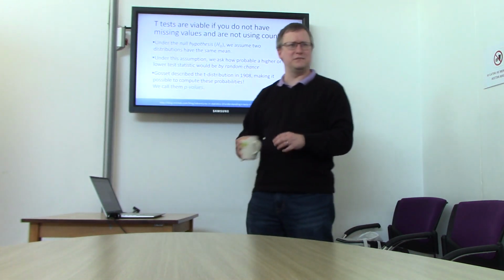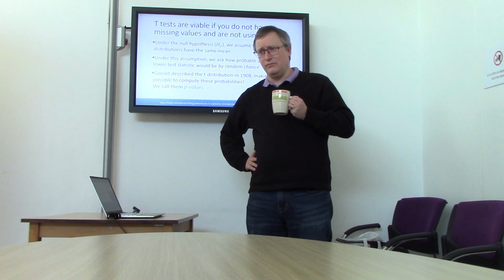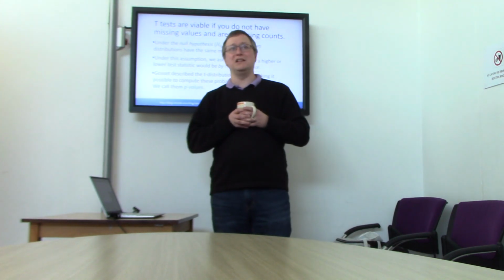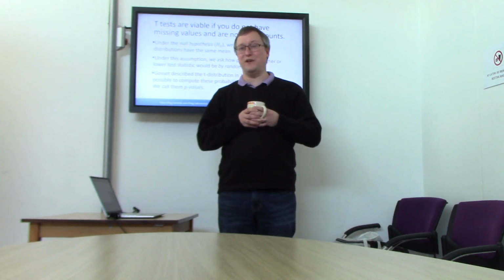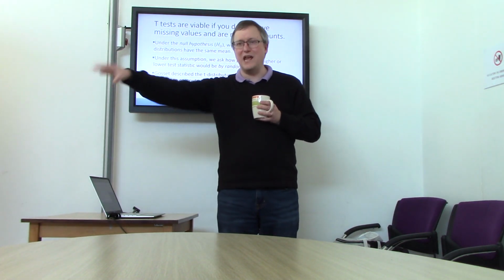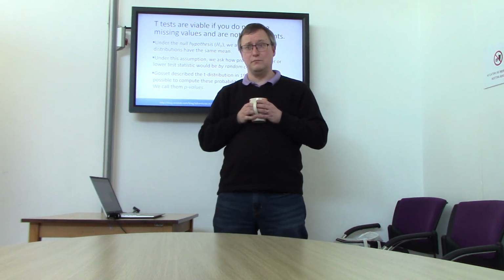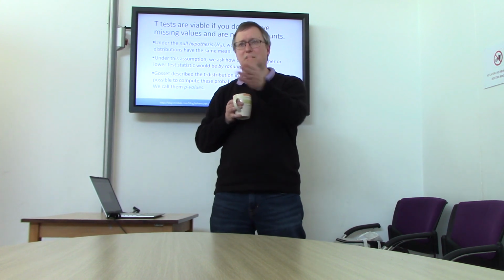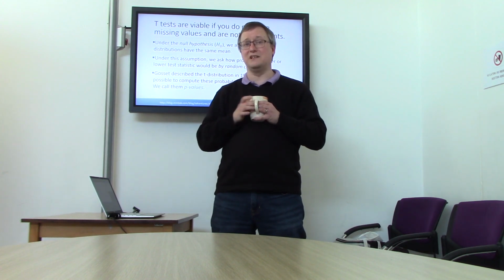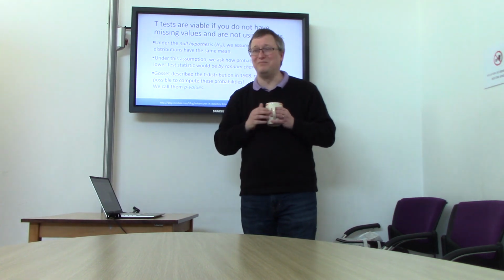So, t-test. We all know t-test, right? T-test is great. T-test works everywhere, doesn't it? Okay, so in a t-test, we have a bunch of values of A and a bunch of values of B. The values are the same thing, but in the A cohort and in the B cohort. And now we hypothesize there's no difference between the values we get from either cohort. We run the t-test, and the t-test provides a p-value that says whether our hypothesis that they're all the same holds up well, essentially.